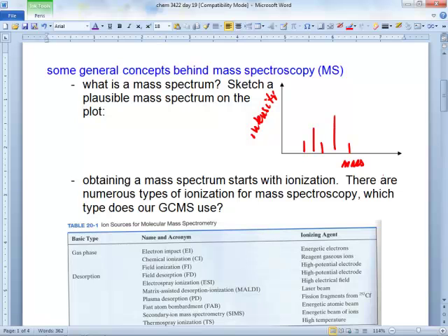Its molecules are all identical. So that means there's a mass spectrum that corresponds to that cocaine molecule, that ethanol molecule, that whatever molecule. A mass spectrum is actually a chemical fingerprint. That's the best way, I think, to describe a mass spectrum. Because when you think of fingerprint, you think identity, everything.